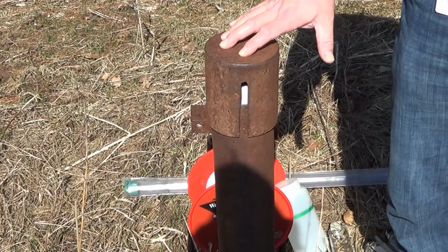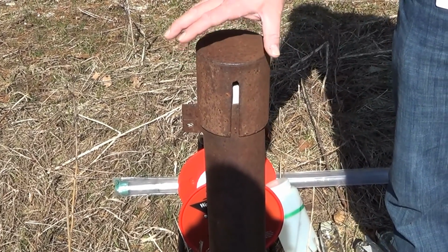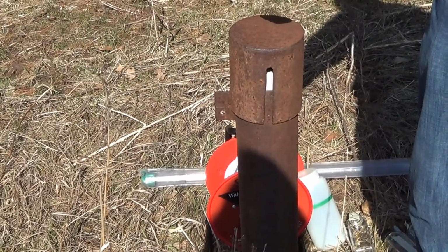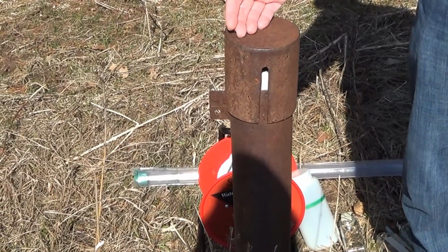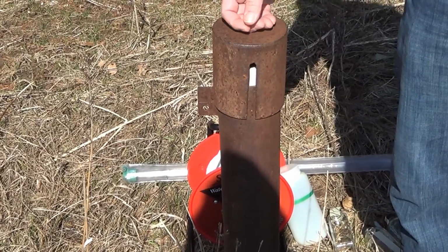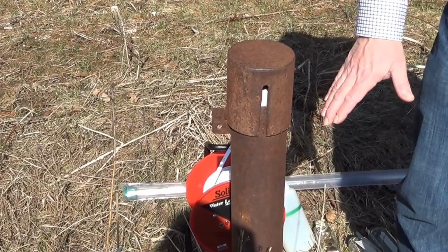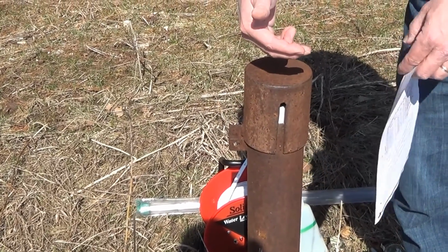So the first thing we do is we determine how much water is in this well. Technically, the water that is standing in this well is not groundwater. It's technically surface water because it's in contact with the atmosphere. And what we'll need to do is use one of these balers I'll show, or other types of balers, and bale out the surface water portion. And the DNR guidance indicates we need to bale 4 volumes of the standing water in this well, in order to be sure to move groundwater into the monitoring well, and then we'll recover our sample.